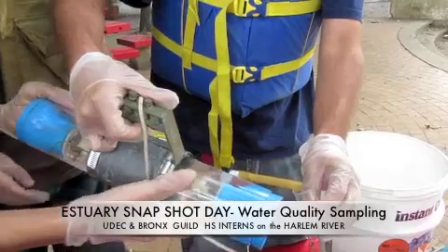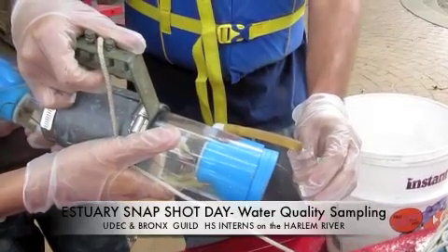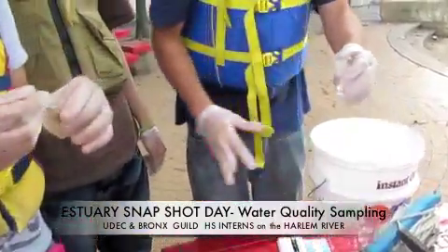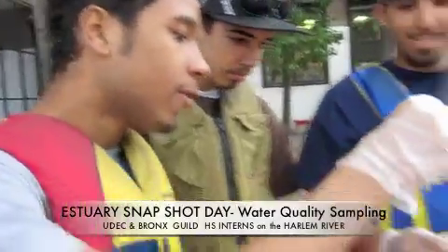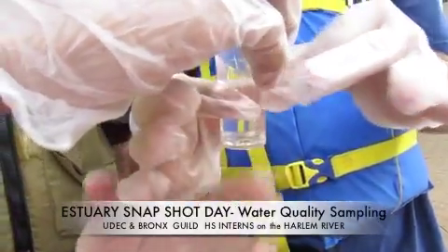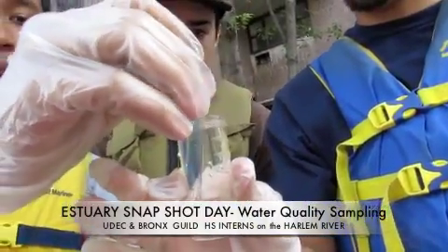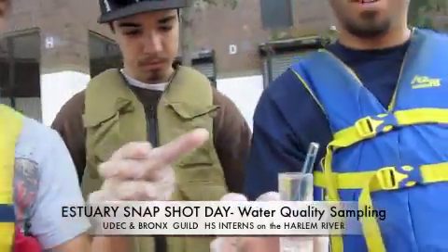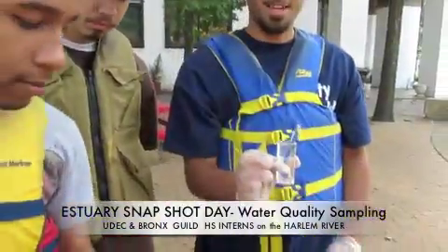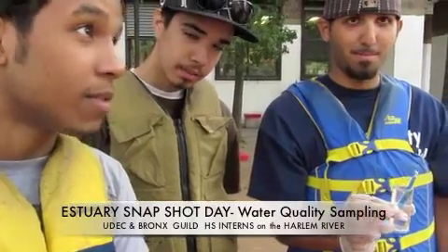Okay, so right now we're just going to put lake water that's condensed inside this, since it's not affected by that. We're putting it over so the oxygen won't affect the reaction. Okay, so right now we're going to put it inside and pop it. And once you pop it, it chemically reacts with the Harlem River's water and turns to a certain color. So after it's done changing color, we compare it with the colorimeter, which is right here. And whichever it's closest to is the number that it's going on. Let's see it, of dissolved oxygen.